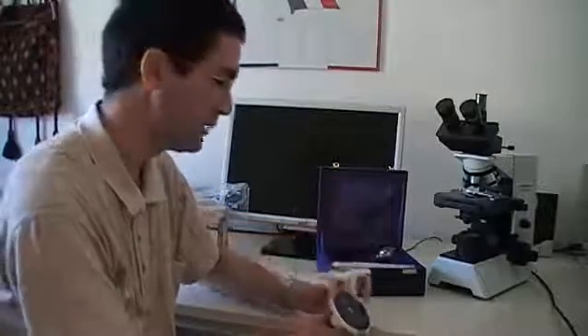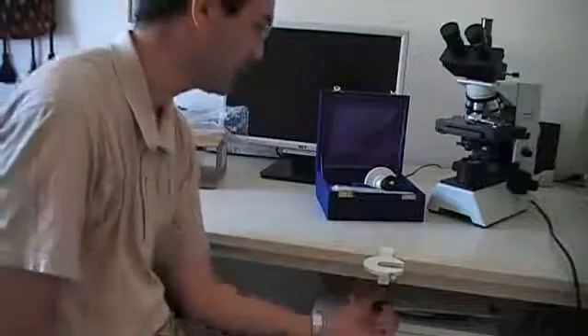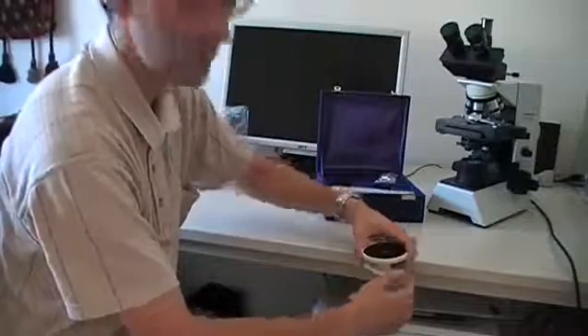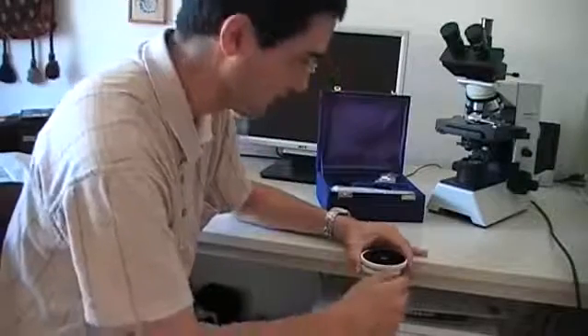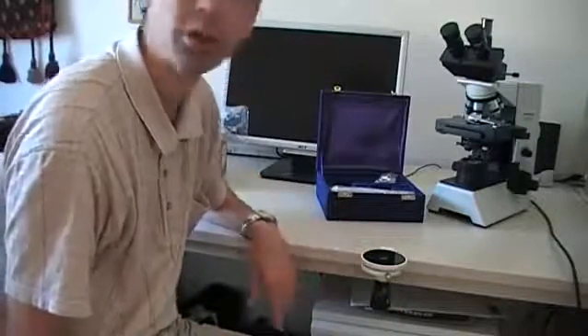The first thing we have to do is mount the hand microtome on the table. You're probably not going to be able to see this because I have to adjust the camera. There's a little clamp over here, and I'm going to mount the microtome holder with the clamp to the table, and also mount the top part over here. I'm going to tighten the screw. Okay, I think we're set and ready to go.